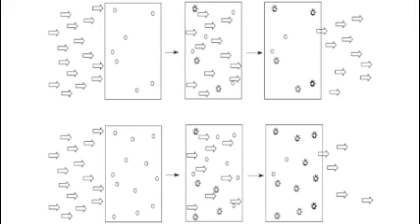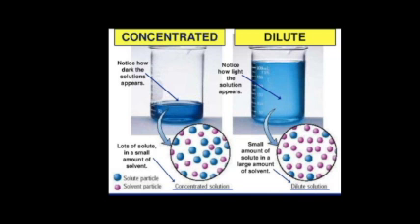Now you might be thinking, what about the other species in the solution, the solvent? Why aren't the photons being absorbed by those particles? Well, they are, but that's why we blank the spectrophotometer, to measure the baseline absorbance of pure solvent and set this as the new 0 of absorbance. There's some interesting math that goes into calculating individual species absorbances when there are multiple species absorbing light, but those are things to look forward to beyond the scope of this course.